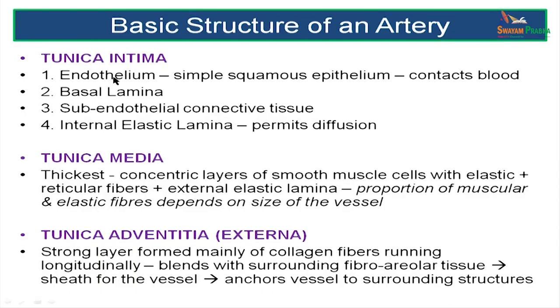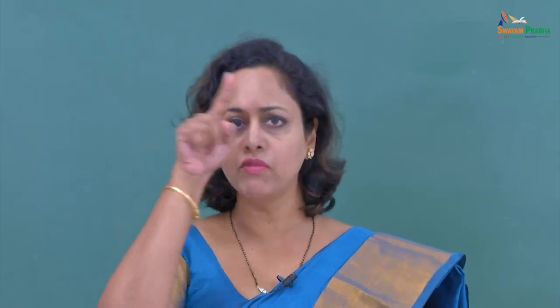Remember that arteries have a very thick tunica media compared to veins, which have a thicker tunica adventitia. The tunica intima is made up of an endothelium, a basal lamina, subendothelial connective tissue, and an internal elastic lamina. The media is made up of the thickest layer of concentrically arranged smooth muscle cells as well as elastic fibres and reticular fibres. The tunica adventitia is made up of collagen fibres running along the axis of the blood vessel.